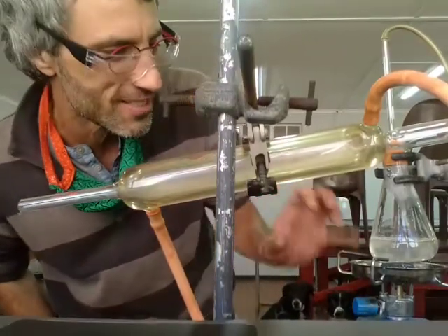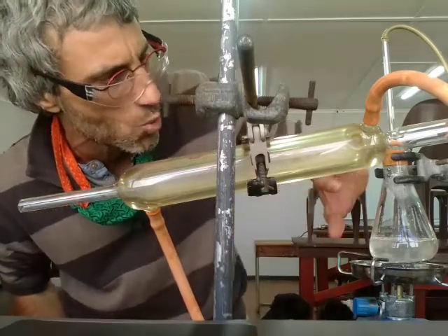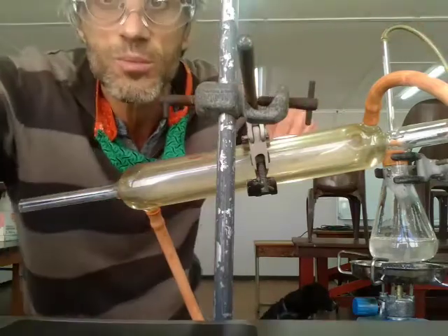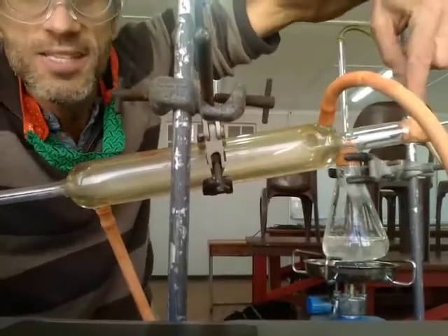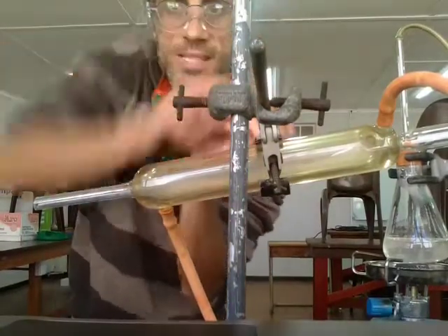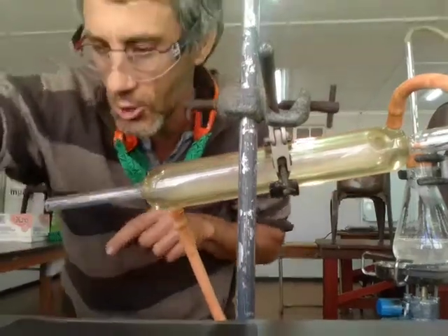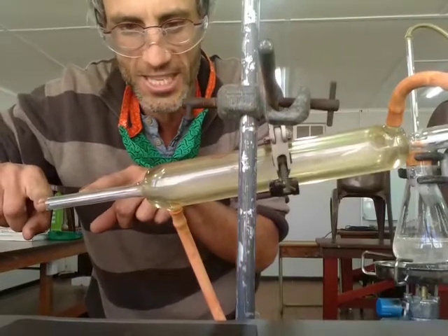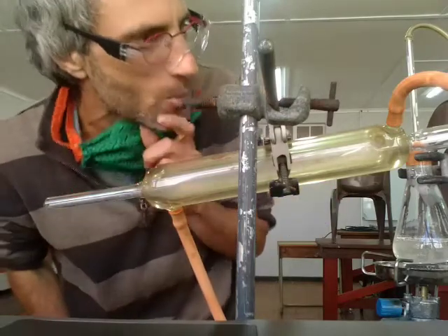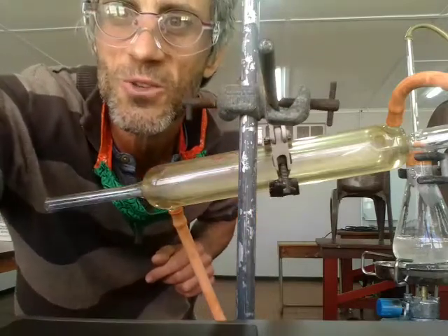So I'm heating the water here, you can see it's starting to boil. The idea is that the evaporated water, the vapor, will go through this delivery tube, over coming to this side. Move you a little bit. We'll get to inside our condenser here. Already water is flowing through from the outside bit, cooling the water vapor that will hopefully collect here. We'll give it a minute or two and see if the vapor will condense back to water and drip, drip, drip on the other side. You can definitely see the bubbles here. So the vapor is starting to go.